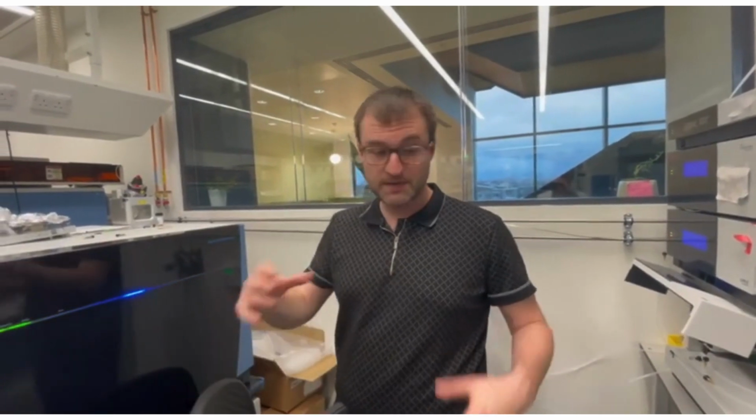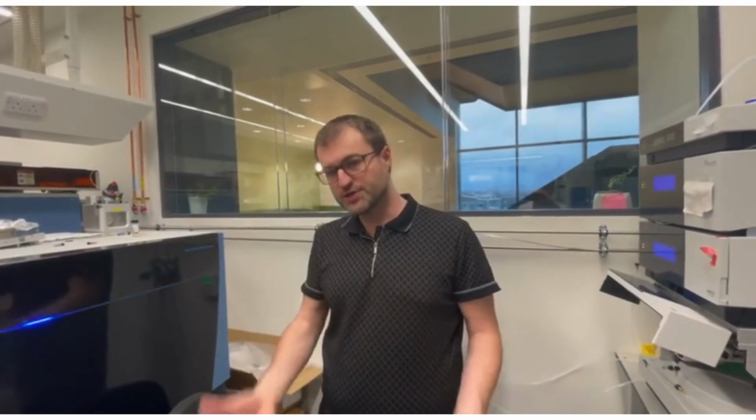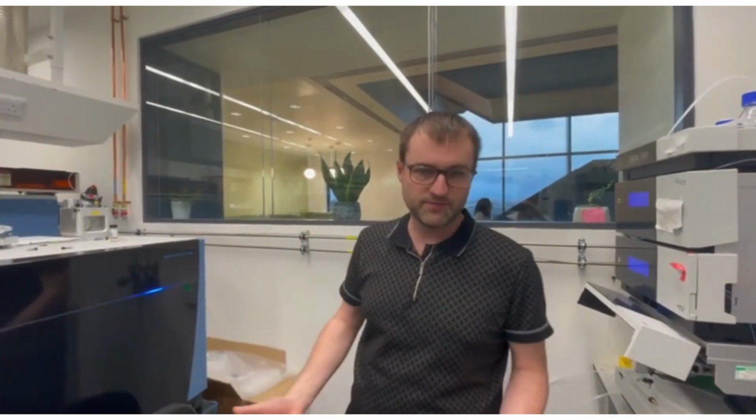They've assembled it on the DNA and performed a ubiquitination reaction. They want to see if they change conditions on DNA assembly, or change components of the complex, how the pattern of protein modifications will change. This is all done in vitro on purified proteins.